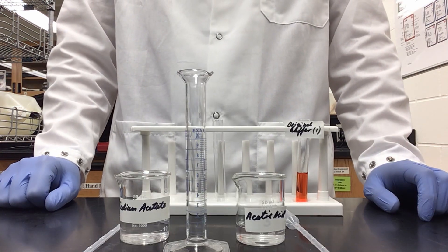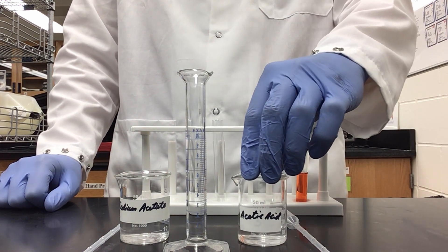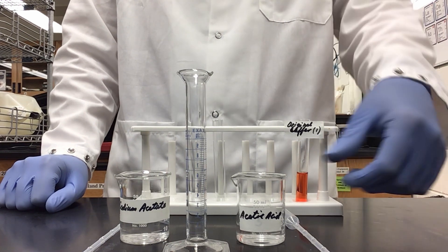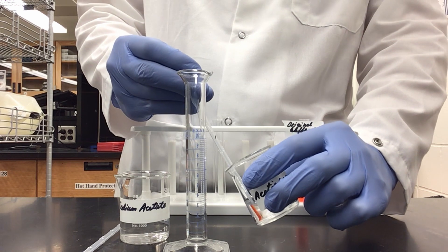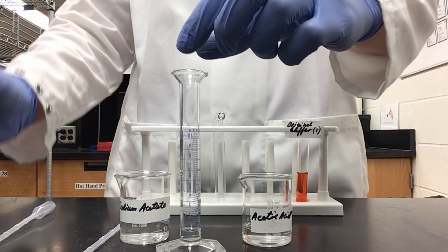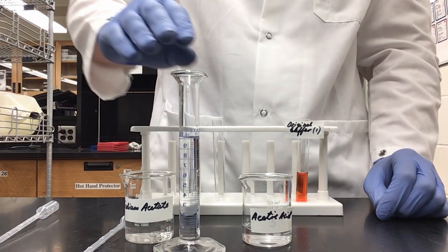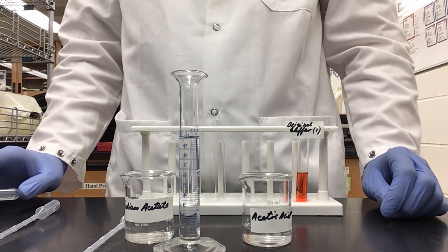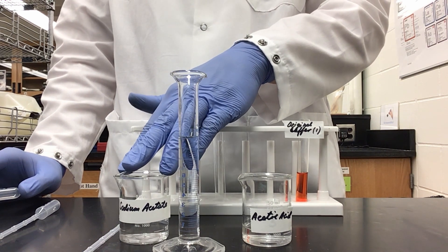Now I'm going to make a dilution of my acetic acid to create a new buffer. I'm going to do a 1 to 10 dilution. I'll take 1 milliliter of my acetic acid into my 10 milliliter graduated cylinder, then dilute it up to the 10 milliliter mark with deionized water. Now I'm going to take equal parts of my diluted acetic acid and sodium acetate and make a new buffer.